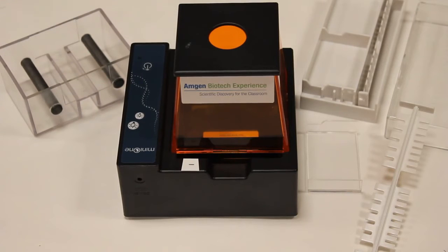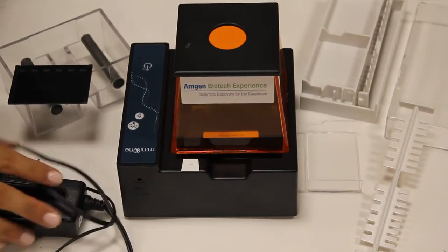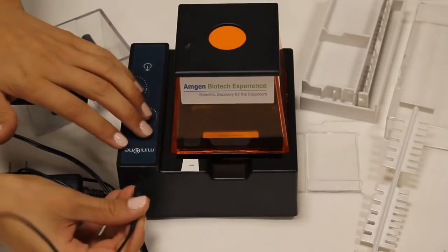Also known as the buffer tank, a black plastic indicator, a cord, and a power supply that is connected to the base.